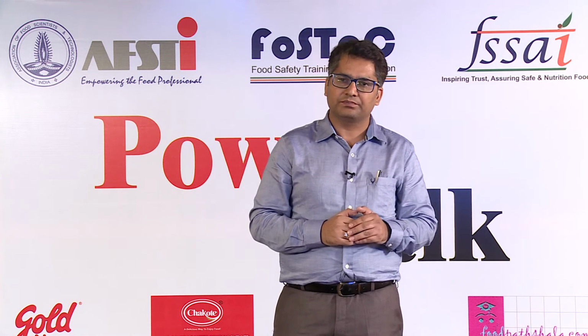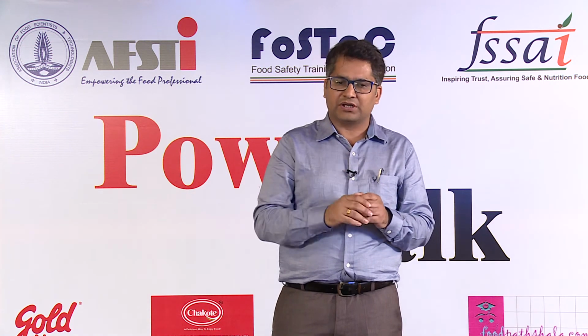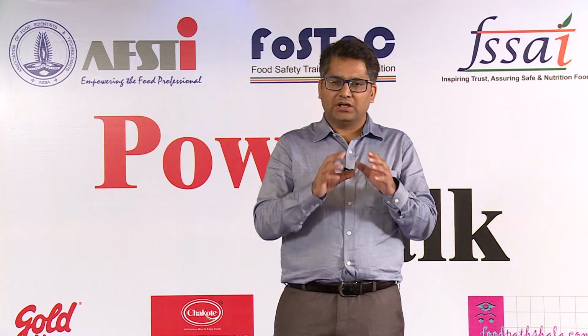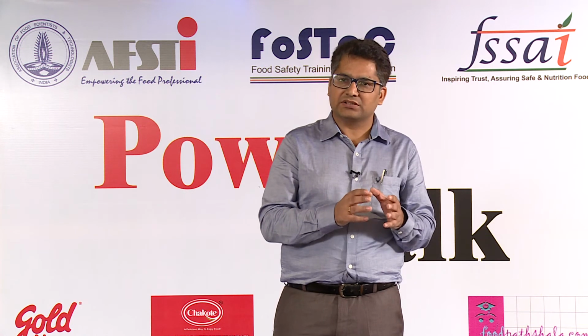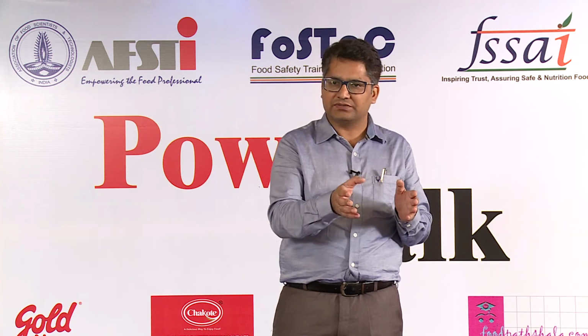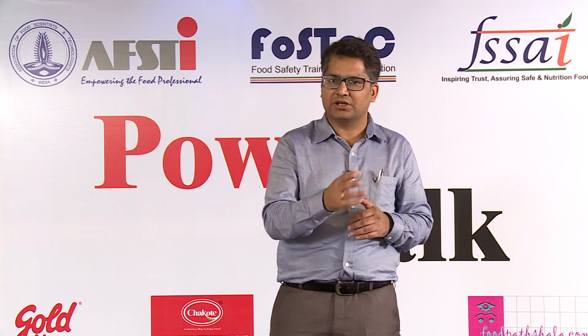Summing up all the steps I have discussed, we can overcome the challenges if we use supra pure grade chemicals, and PTFE ware instead of glassware, which will not contaminate and cause overestimation or underestimation.